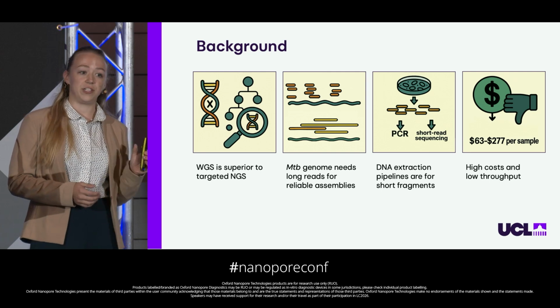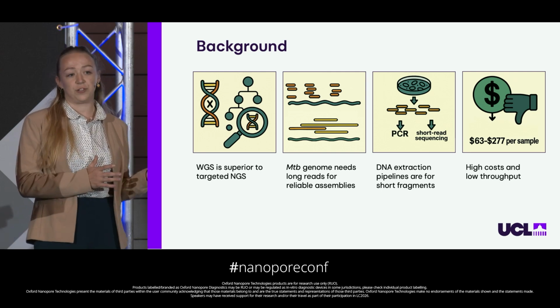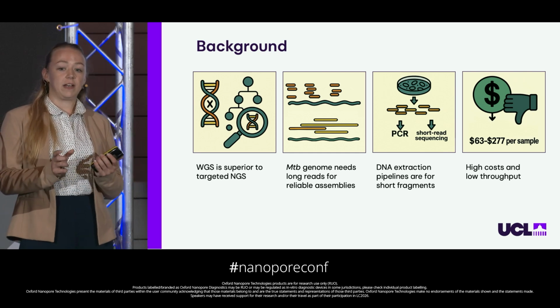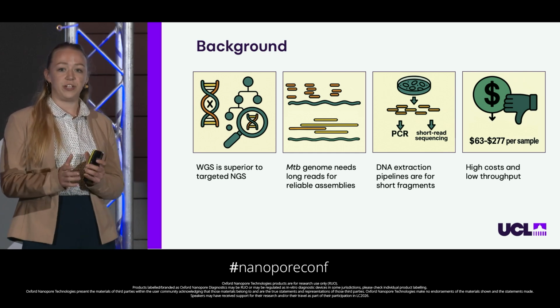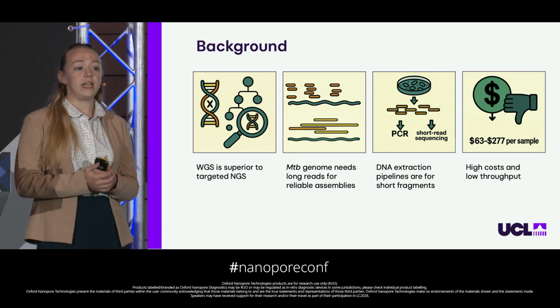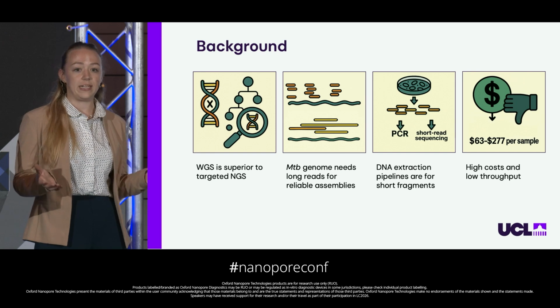And there are also regions of the genome that have just always been blanket discarded using short-read technologies. That's because these short reads can't align to long repetitive regions of the genome, as you can see in the top of the second figure. So we need long nanopore reads to bridge these regions and be able to make complete and accurate alignments.